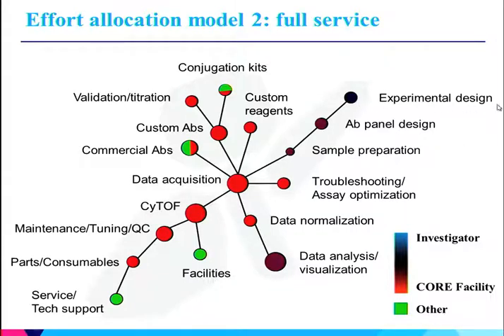So there was also a very heavy involvement at the experimental design phase. While the experiments themselves were generally conceived by investigators, there was a lot of education involved early on in the process. And a lot of it's just about appropriately managing expectations. One of the senses I got early on was that people were very aware of the pros of the CyTOF. It's a flow cytometer, but you can do 300 parameters. That actually isn't what you can do with a CyTOF. So a lot of it is limiting, designing experiments to actually take advantage of the technology, and also keeping in mind some of the limitations.